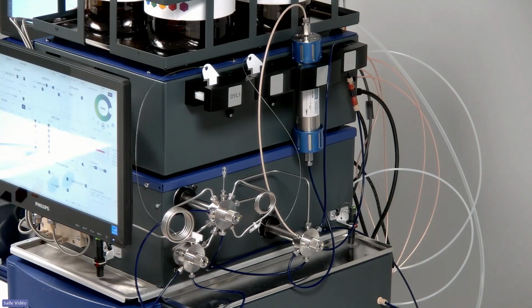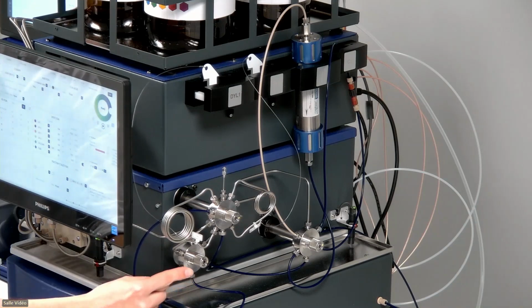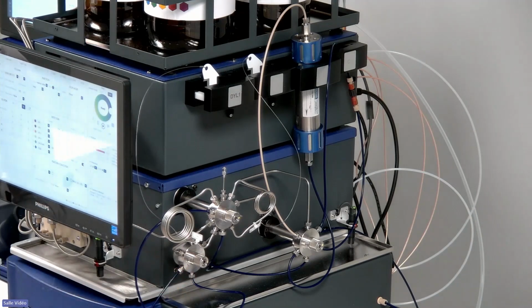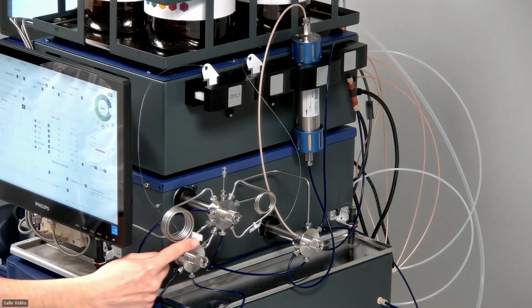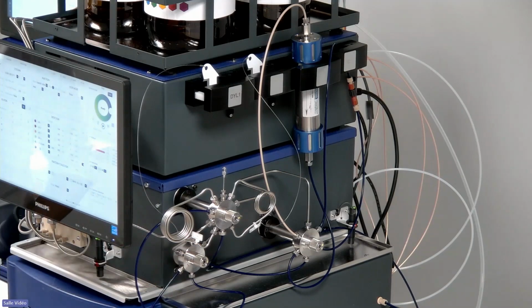The selection and the injection on the column are managed by a couple of valves. The first one, just here, is the repartition valve to choose between column 1 and column 2 or 3. The second valve, here, is the injection valve that can manage a dual injection.